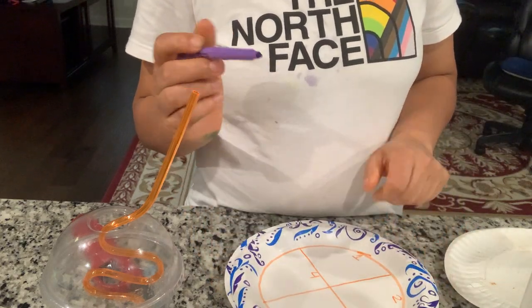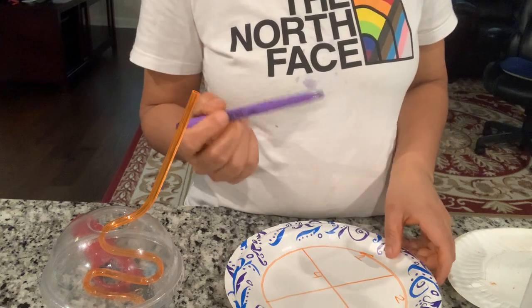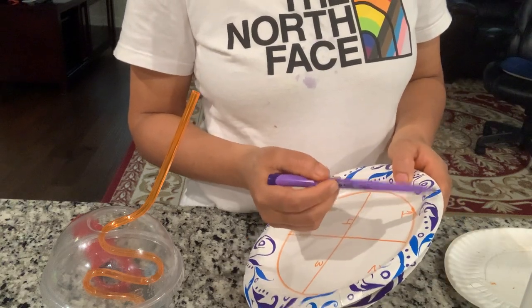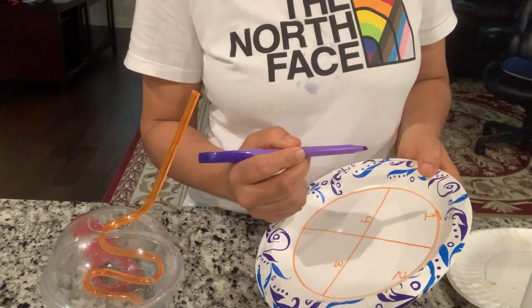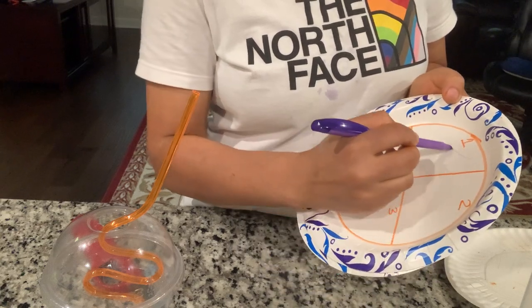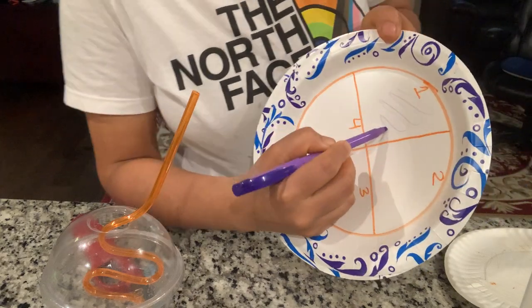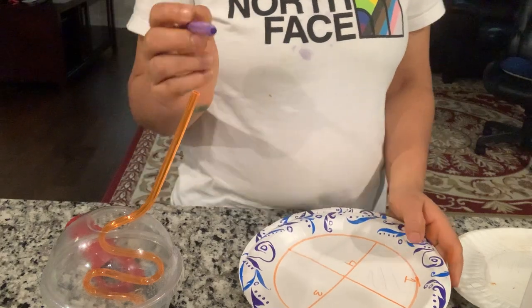I'm going to put this loop on the flame and let it cool down. Now I'm going to draw the straight streak on quadrant one, just like this. Then I'm going to put my loop back on the flame.